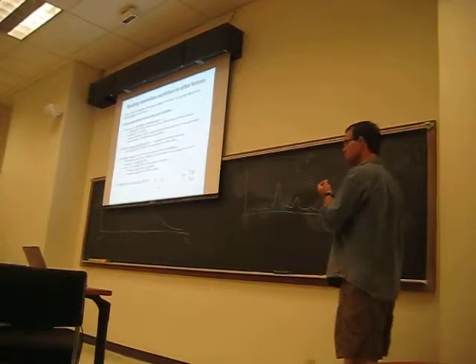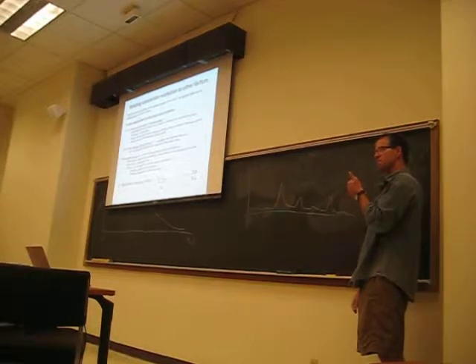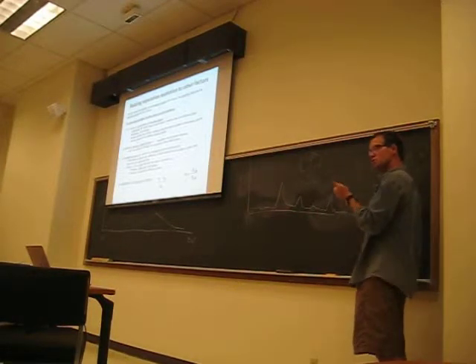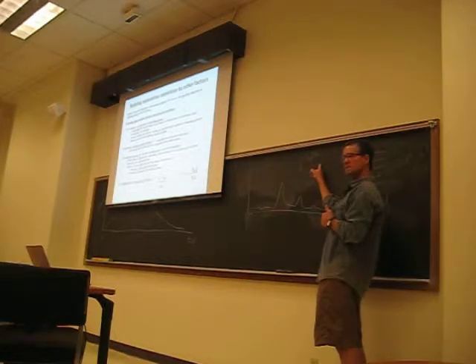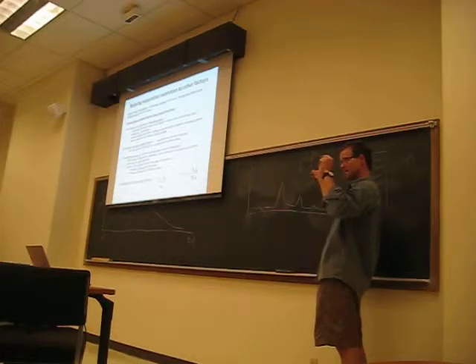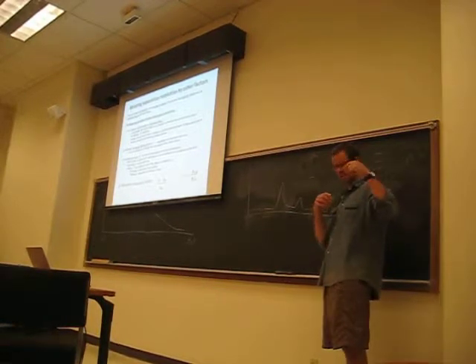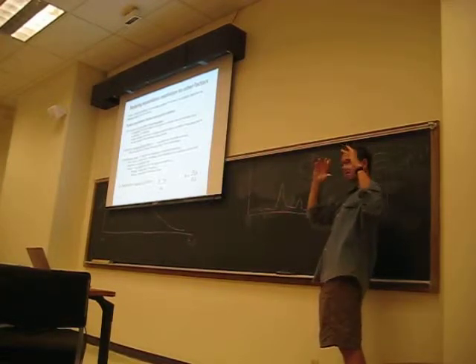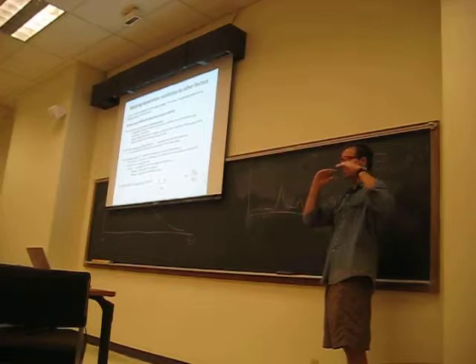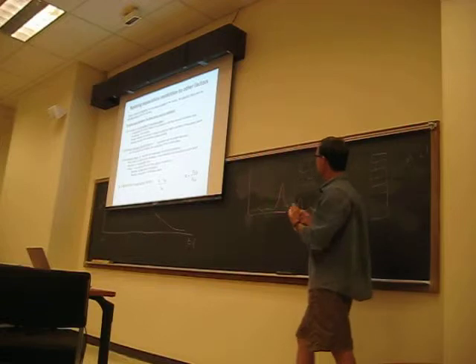The resolution potential of the column is increased by increasing the number of theoretical plates, and the way we achieve that is to have a smaller bead size. The plate height, which is what we're trying to minimize, is this theoretical construct. It really refers to how much of the surface of the stationary phase we have to interact with analytes in the mobile phase. Okay. And that's what that's saying here.